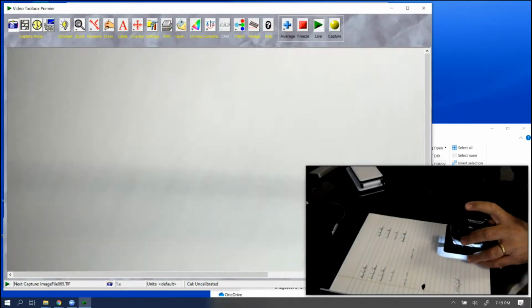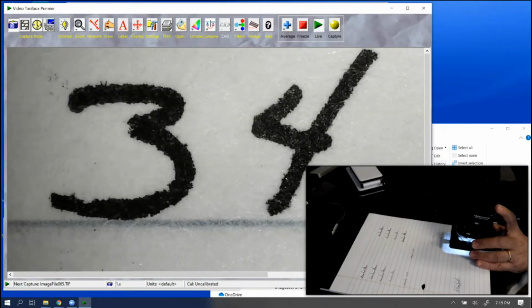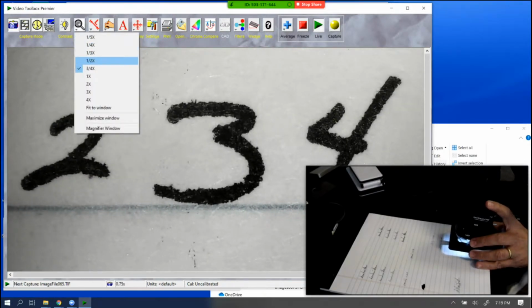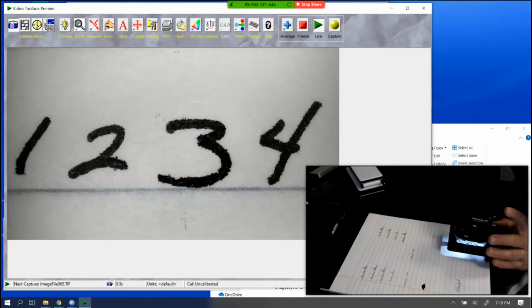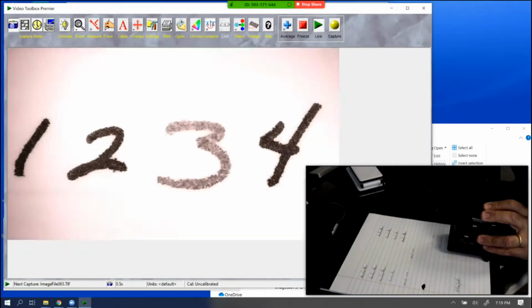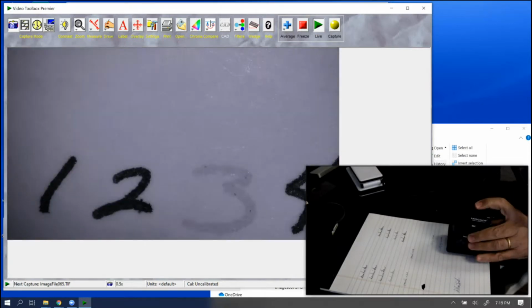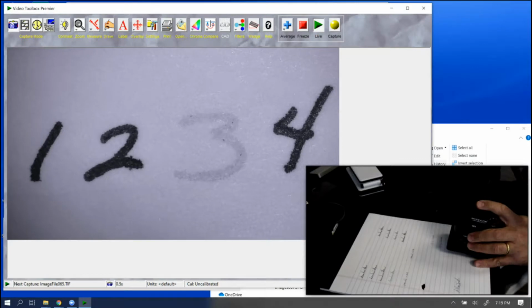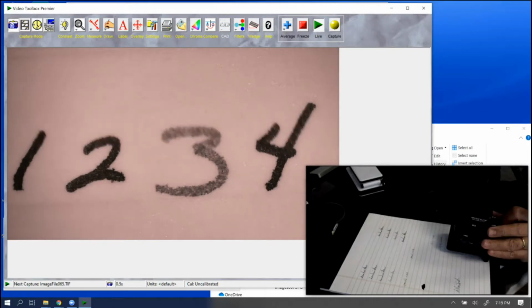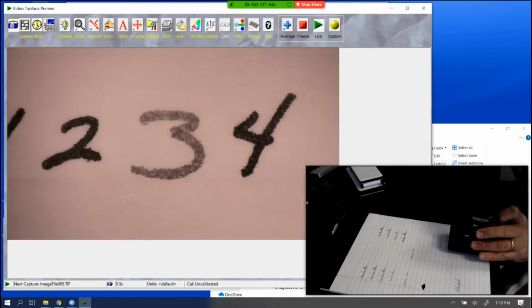And now we can look at samples where there might be multiple inks that we would like to be able to distinguish. So for instance, here, I'll just bring these images down a little bit so that we can see everything in one. So here's a sample with what looks to be three identical inks, but here we can see by switching into the infrared that one of these inks is actually different. So again, white light, infrared.